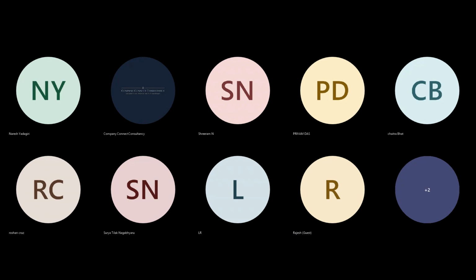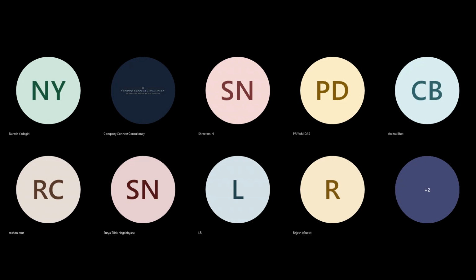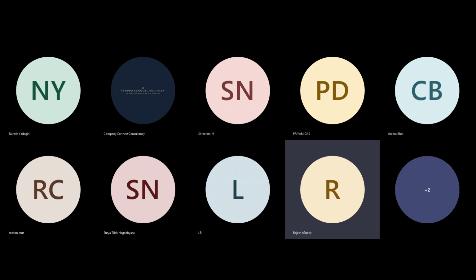Means we'll discuss how all the tables are built in LabWare LIMS, but of course we don't have access to the servers, right? So I cannot just go and tell you how the files are set or how things are there at the back end at the server. Because LabWare LIMS is itself a COTS product, and I don't have any demo version of it where I can run and show you. I have certain screenshots, because they won't give you a single copy.